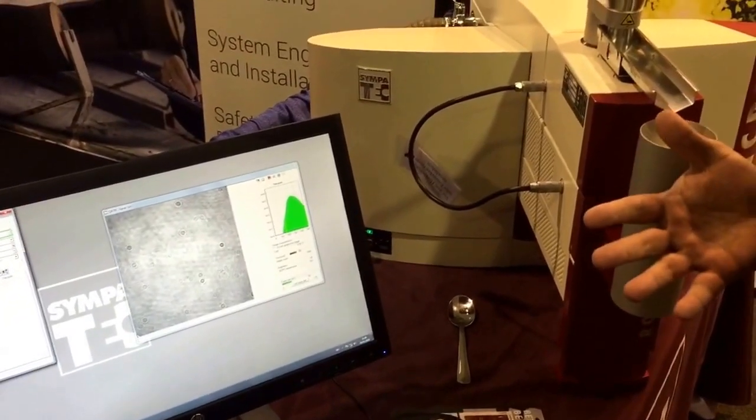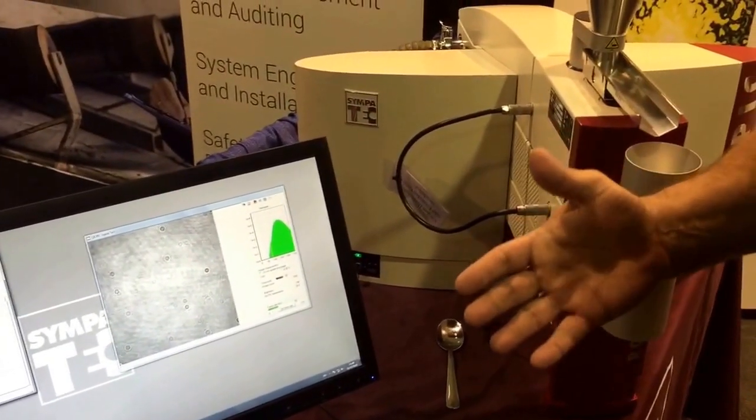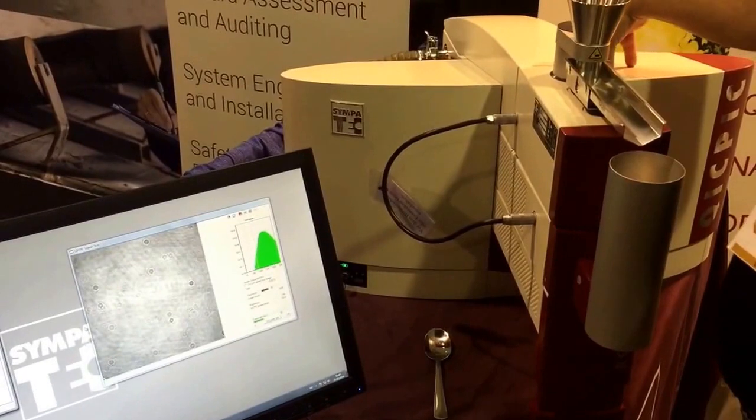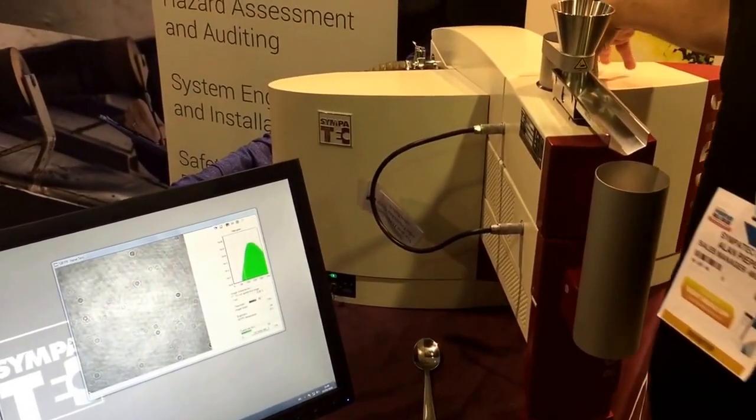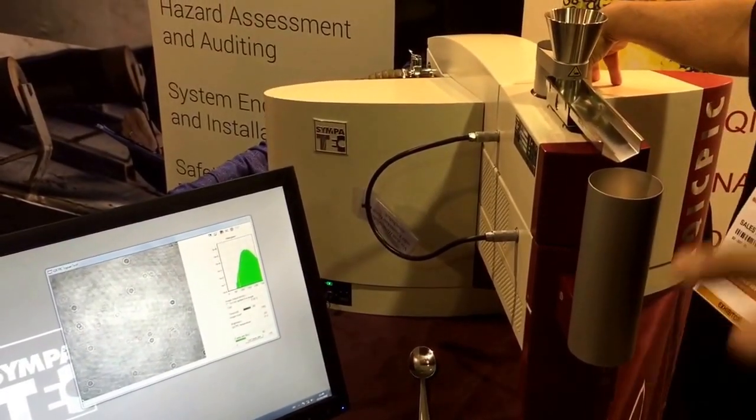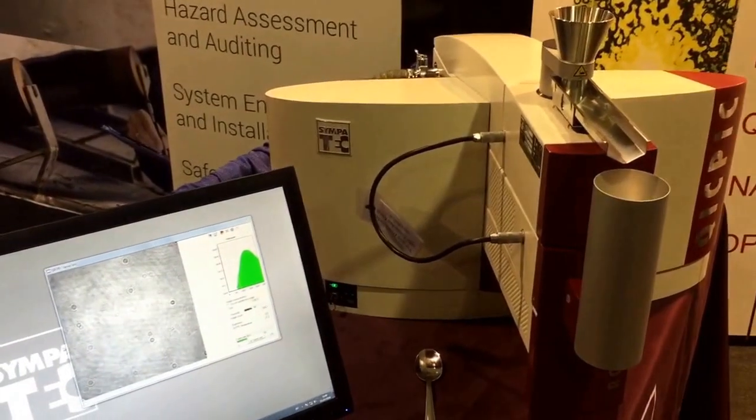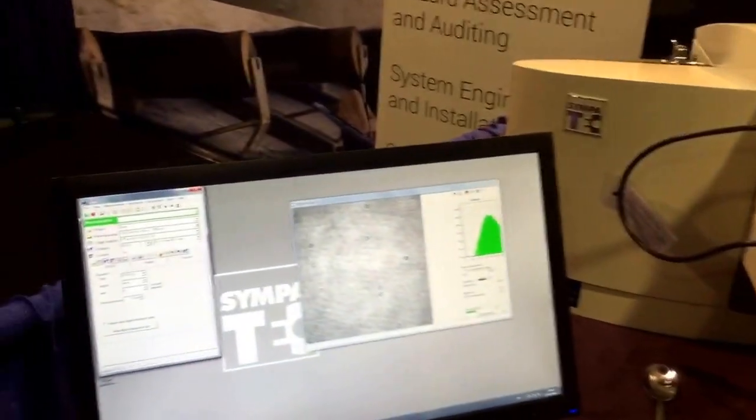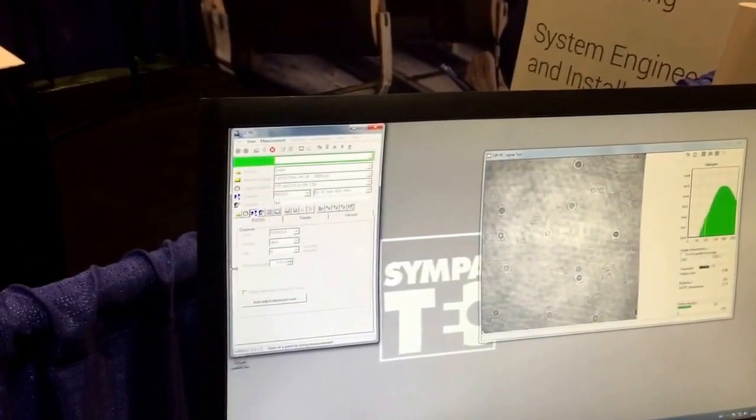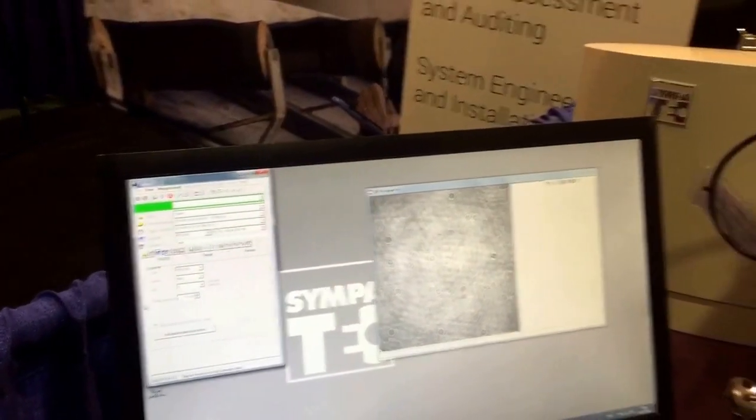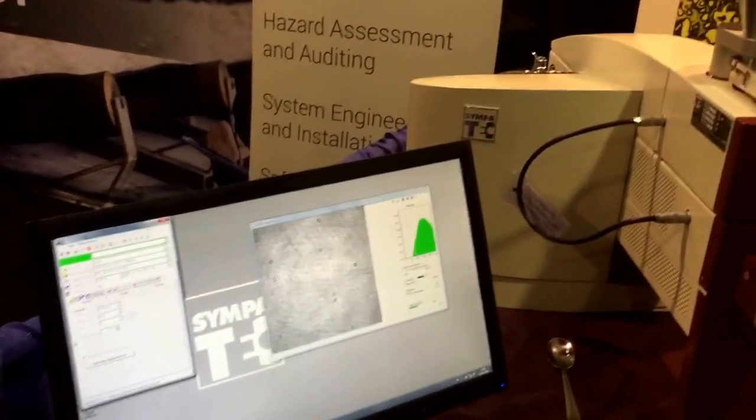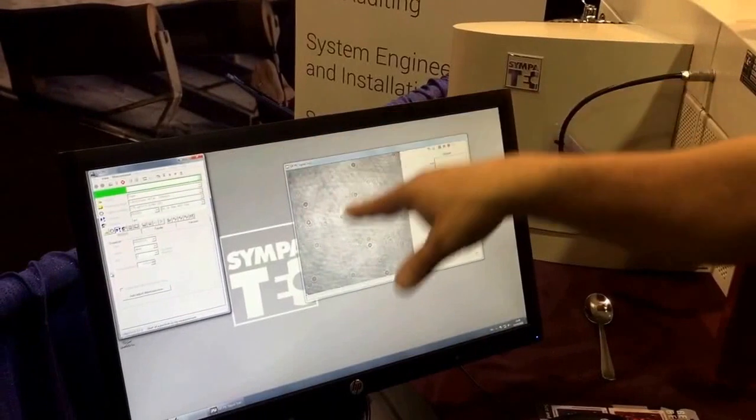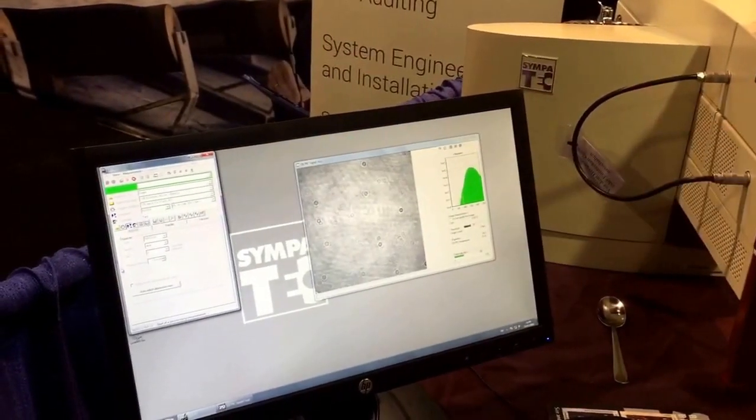Such as particles on a slider sitting on their flattest side, there's orientation bias. Secondly, they're not dispersed. And thirdly, there's a few particles on the slide. Here we're going to measure potentially millions of particles in an analysis, so the statistics become really good. Let's go ahead, I'll click the green button for go.